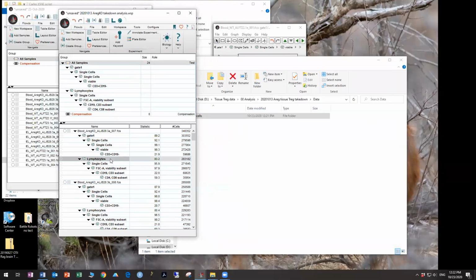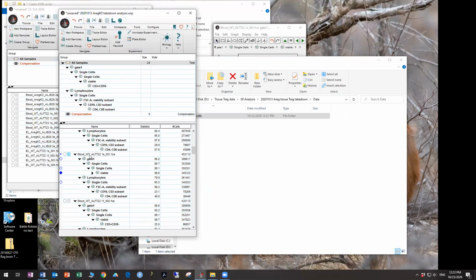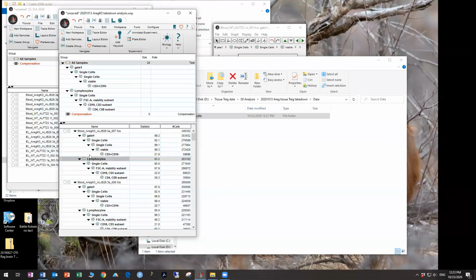As you'll notice here, this matrix design is the compensation matrix. So some of these are blue and some of them are gray. By default, the Aurora data will come up with gray because there is no compensation matrix applied, or that's the acquisition defined default matrix. In some cases, you may need to apply a compensation correction, particularly if there's tandem breakdown. In this particular experiment, I had to do that.